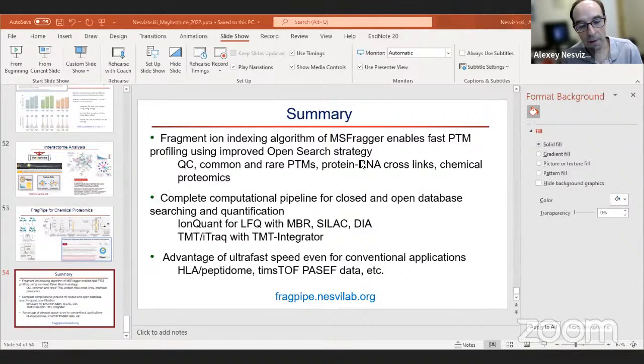And if it's DIA, that's a little bit of a partial solution right now. We'll build the libraries that contain the phosphosites, and DIA-NN has ways to quantify the phosphopeptides and report some additional information that's useful for knowing how confidently fragments were extracted specifically for those phosphosites.